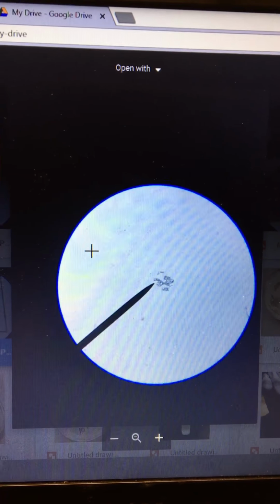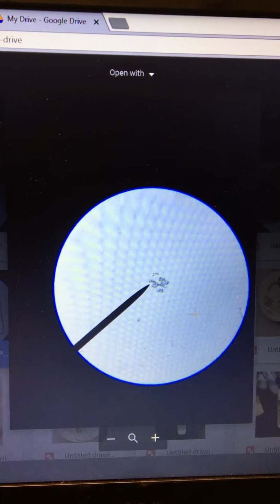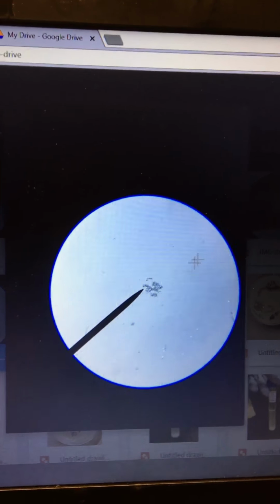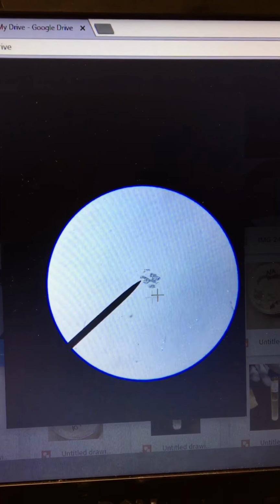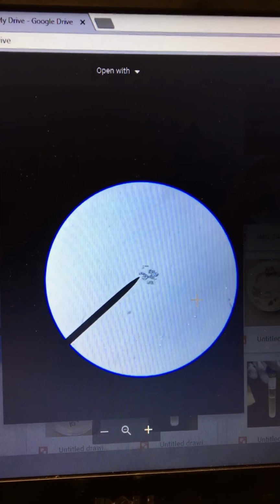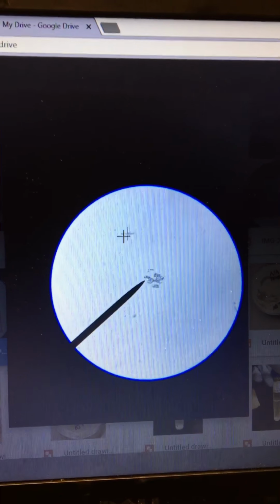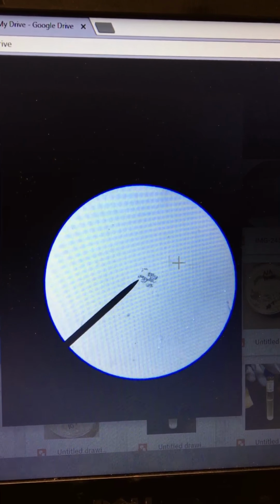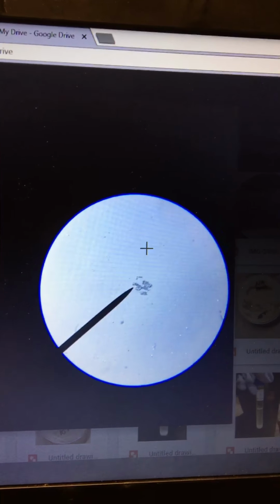Okay, so this is the Bacteriococcus slide. I described my issues with it before in my lab report. I went into more detail. It took me 3 hours just to get this specimen. This is scanning power. I did not see a single thing on this slide. I had no trouble at all with the other slides locating the specimen. So I'm thinking either there was an error and this one just wasn't included with the specimen, or that's it. I couldn't really tell.